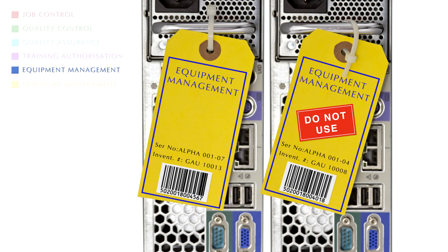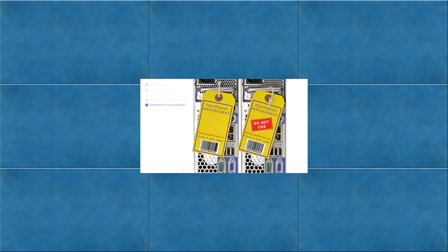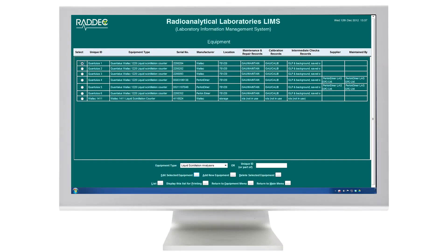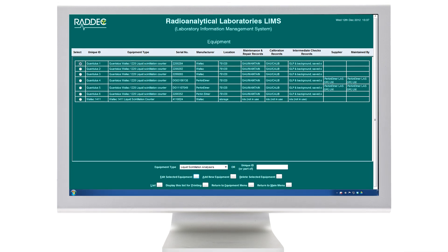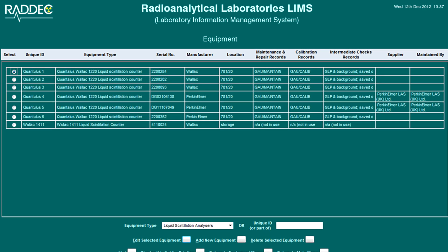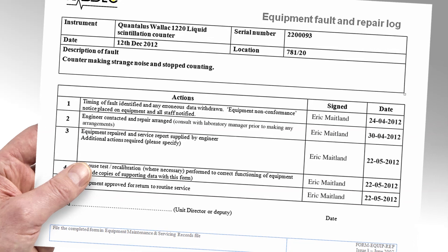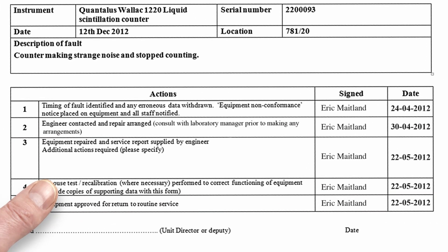Equipment management. Equipment records are maintained via a searchable equipment database. Details of equipment serial numbers, locations and suppliers are stored for individual items within equipment group categories. The database incorporates an equipment fault log facility permitting detailed recording of equipment status, fault details and repair details, and permits fault trending. LIMS produces a detailed fault record for each fault logged.